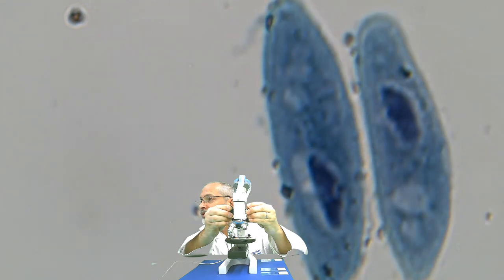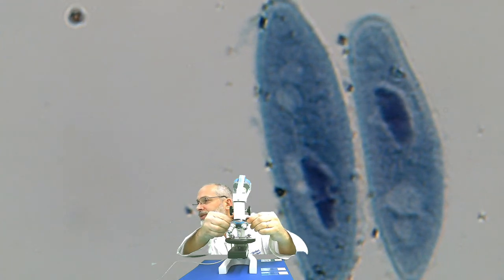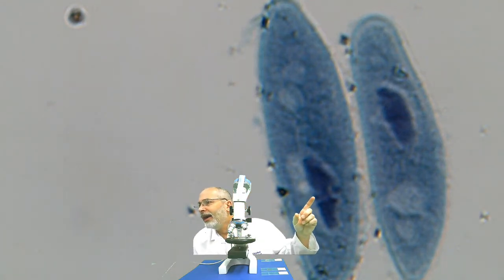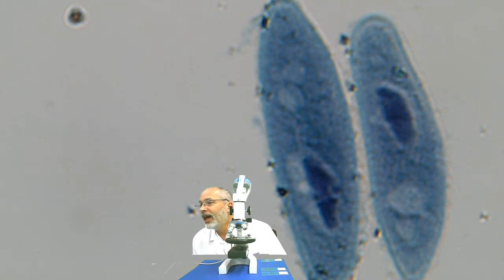And I will give you some time to draw either one of these Paramecium. I will point a couple things out while you're drawing, however. This is kind of cool. This area here, the darker area, is the nucleus. And if you look at the lighter area that kind of looks like lips, they almost are. That's called the gullet. The gullet is where the Paramecium engulf their prey.